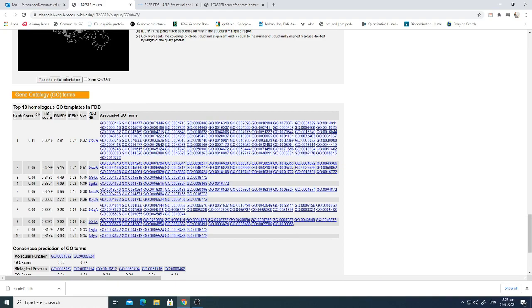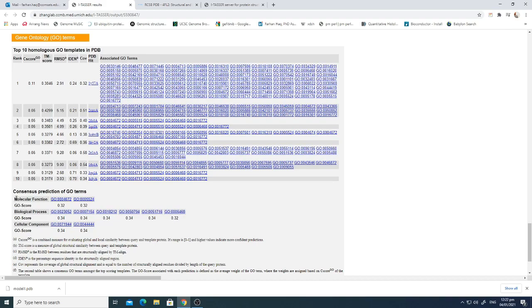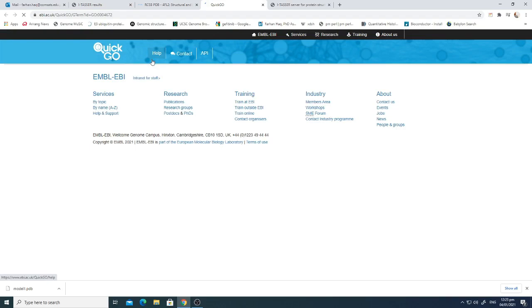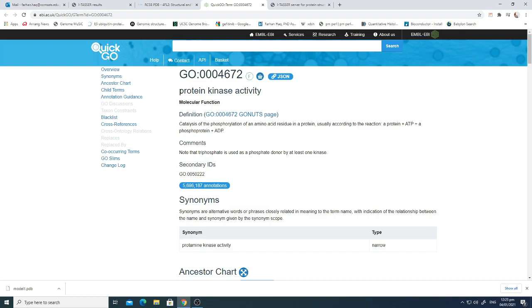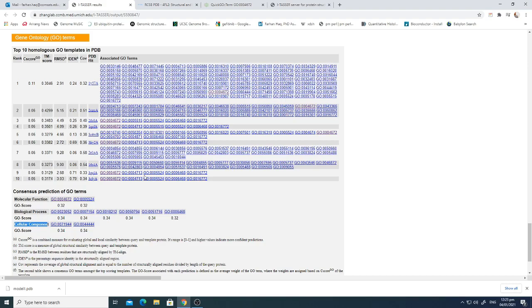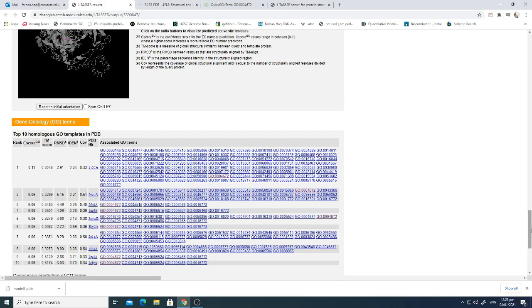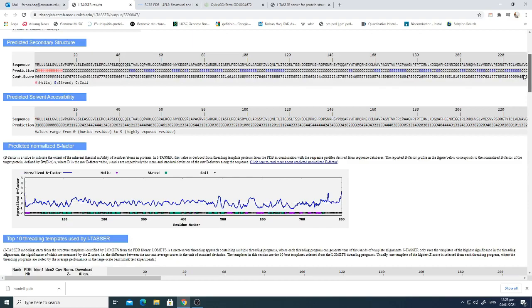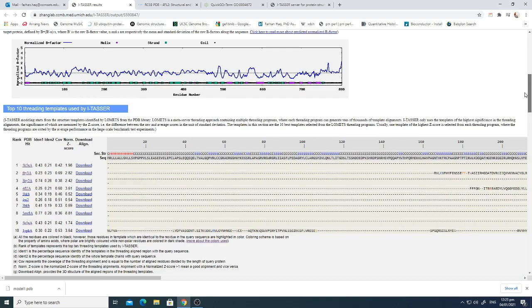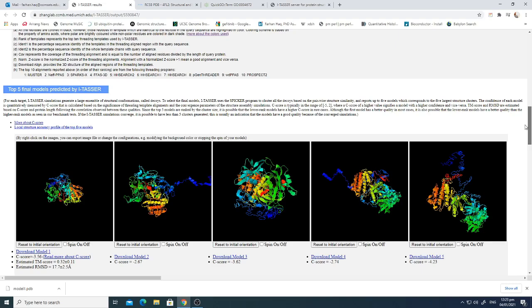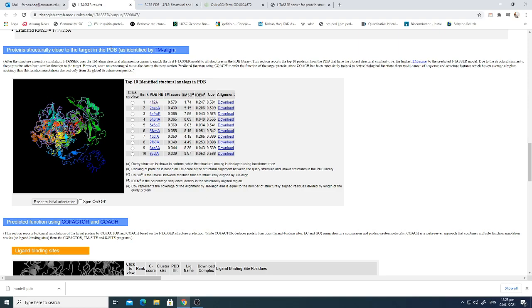All details related to gene ontology of the protein sequence are also mentioned, based on alignment, C-score, TM-score, RMSD, and PDB hit. Gene ontology tells us about the molecular function of the protein, the biological process the protein is involved in, and the cellular component. Clicking the gene ontology link takes you to the website where you can see the function details — for example, protein kinase activity. Overall, you can find information about secondary structure, solvent accessibility, templates used, five possible 3D structures, and the best closely related PDB targets.